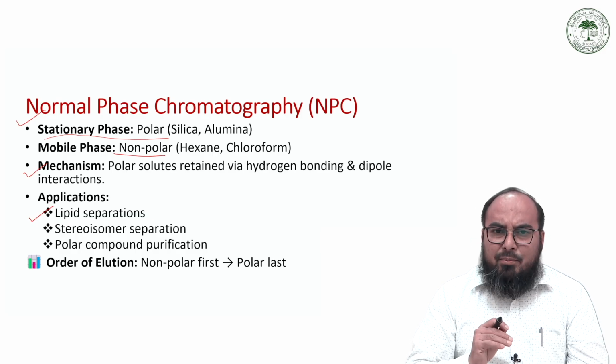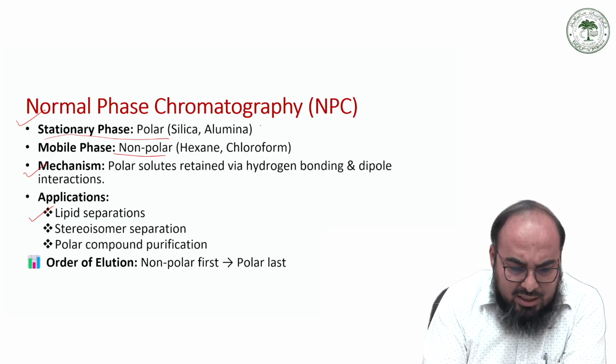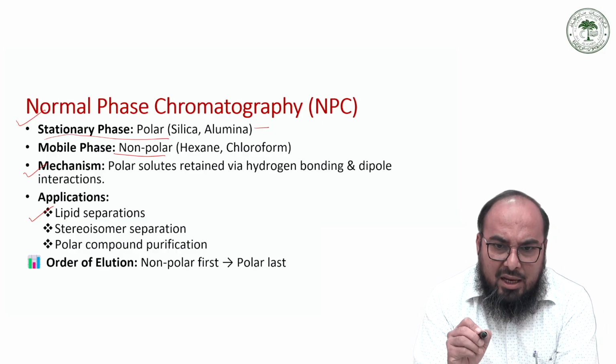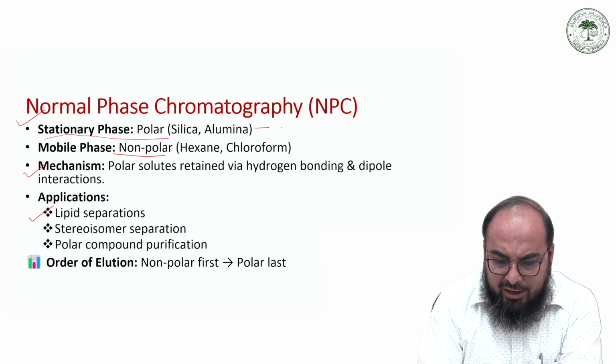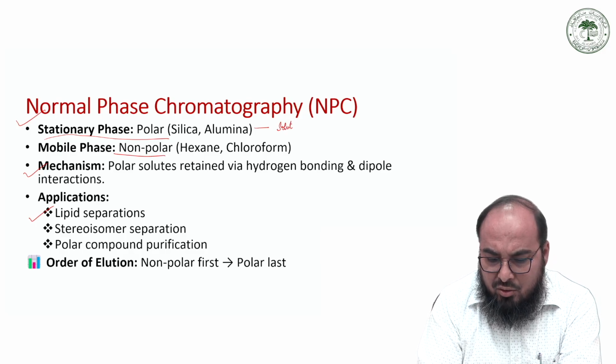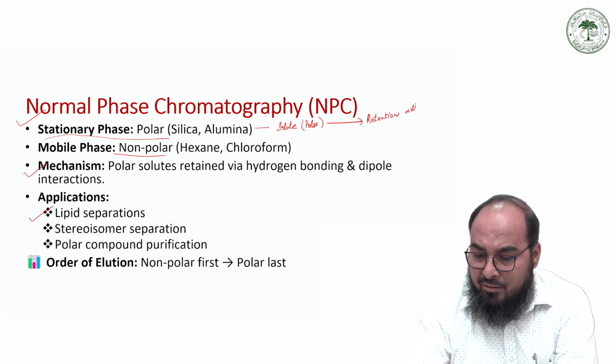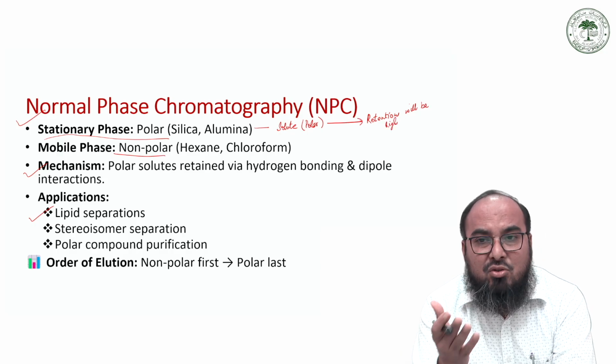Now, the important point you have to remember is that here your stationary phase is polar, and if your solute is polar, then the retention time will be high, because the interaction will be strong.